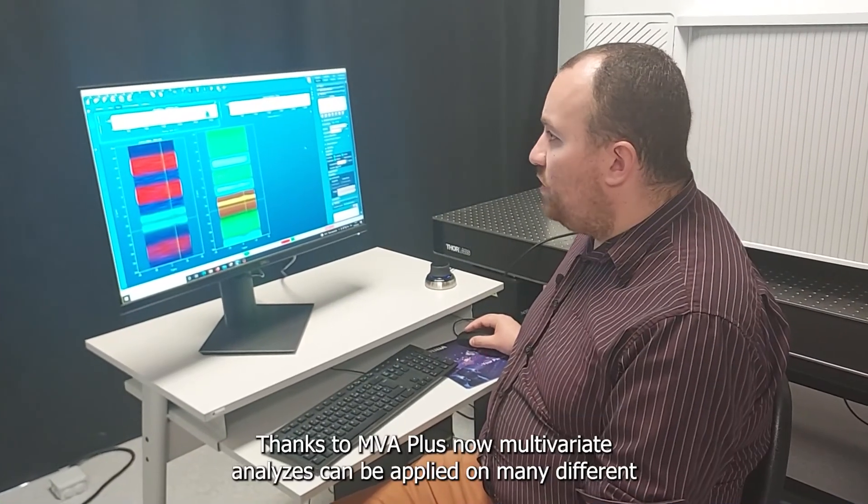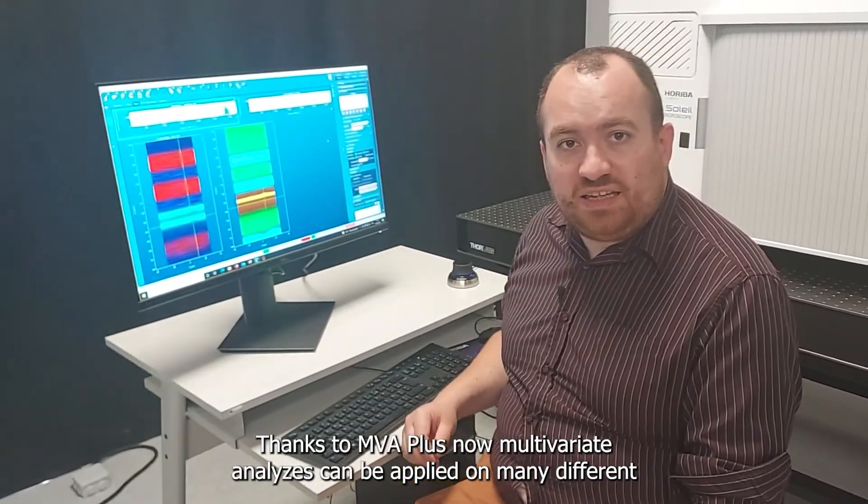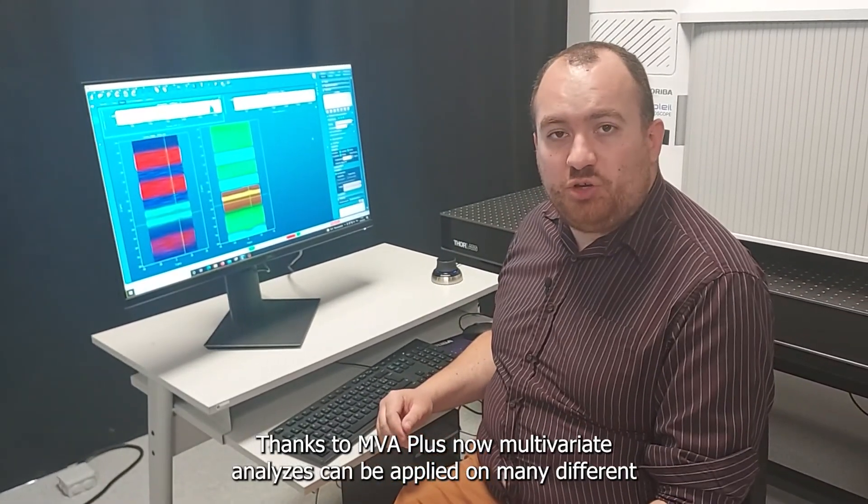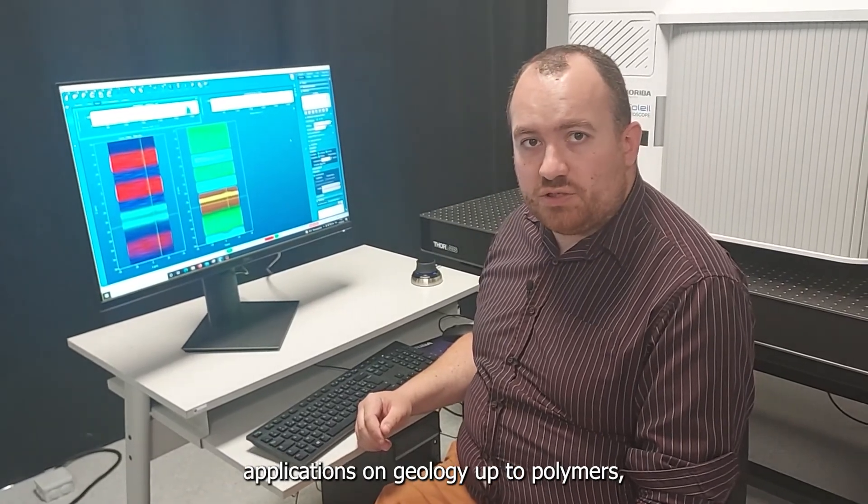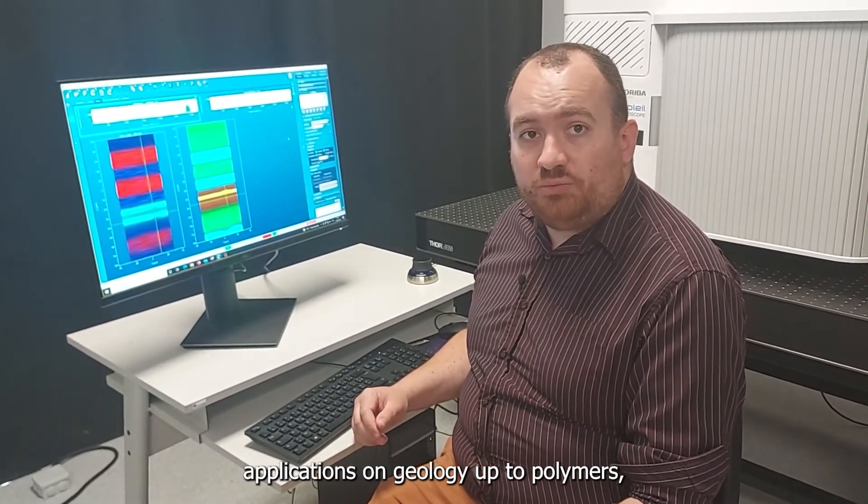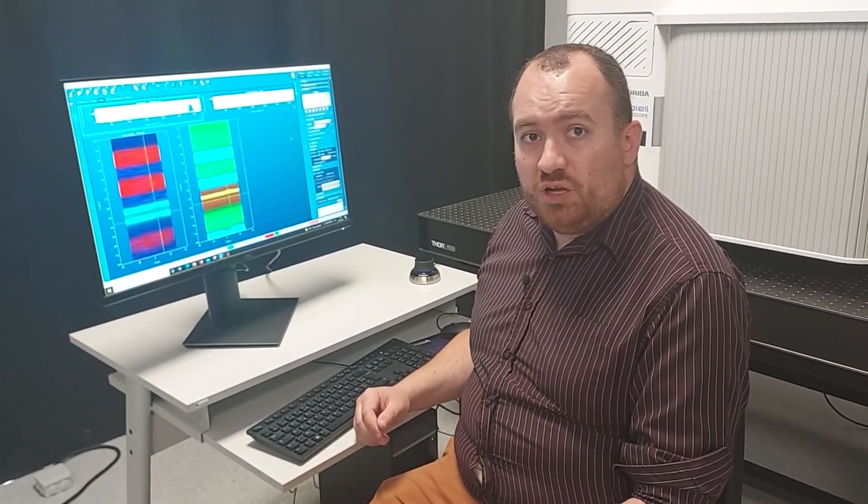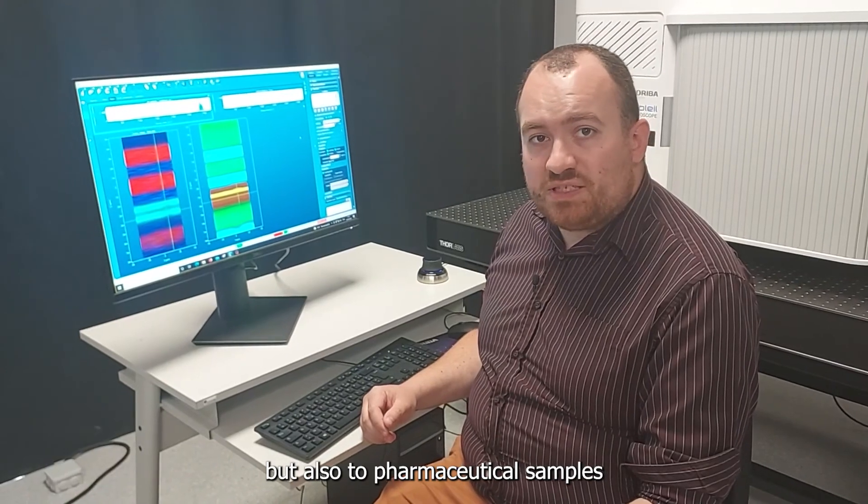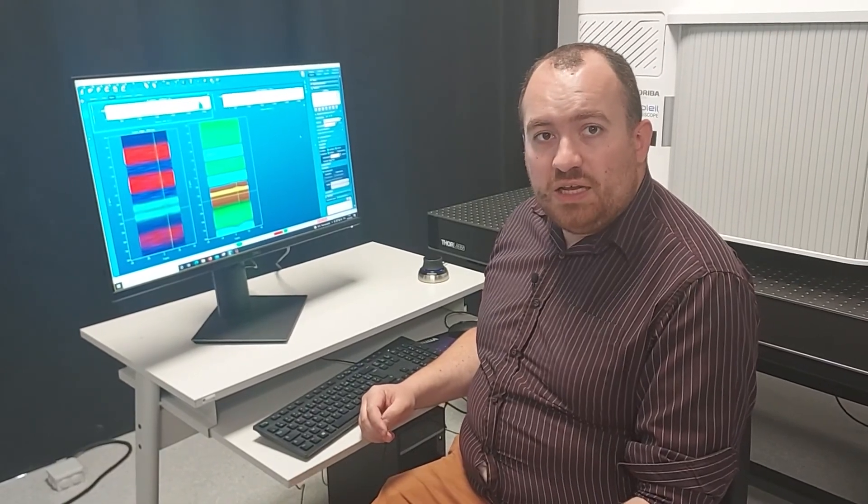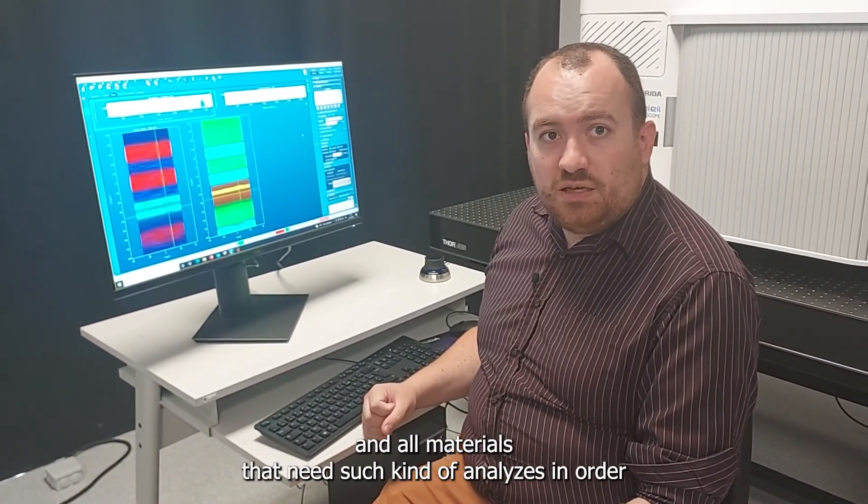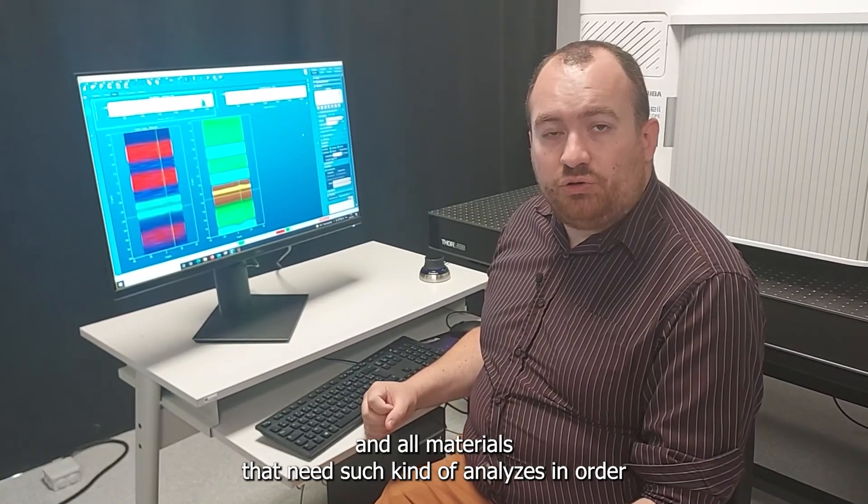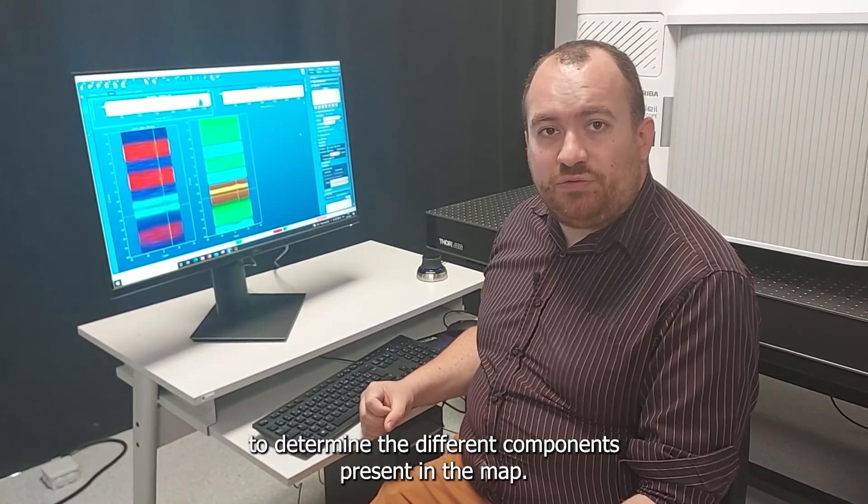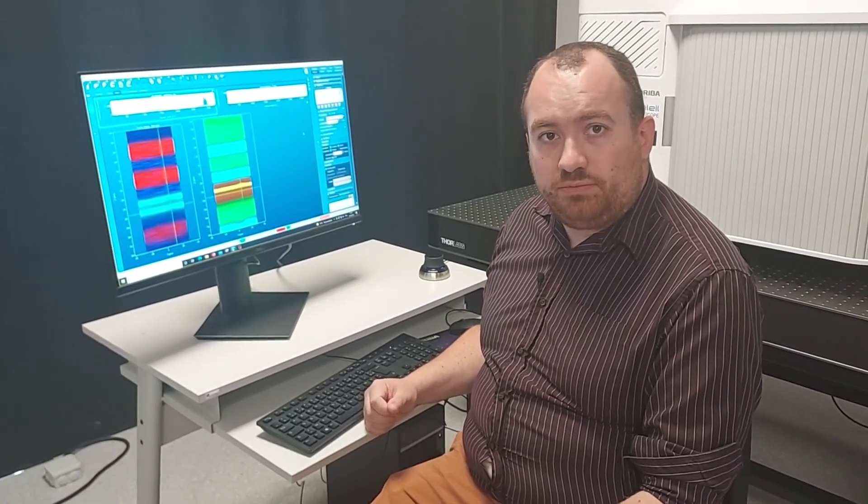Thanks to MVA Plus, now multivariate analysis can be applied on many different applications: on geology up to polymers, but also to pharmaceutical samples and all materials that need such kind of analysis in order to determine the different components present in the map.